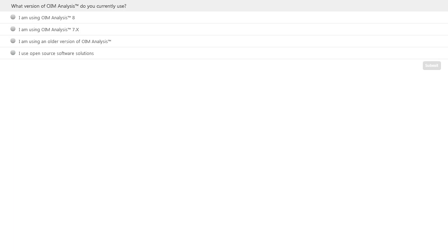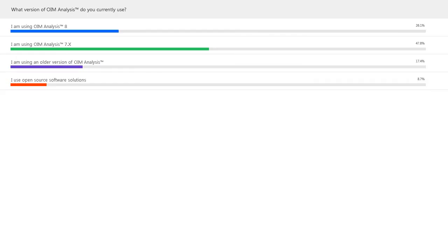So go ahead and give this a minute to see how it works. It's going to be interesting to see how this turns out. Oh, okay. So here's our current breakdown.